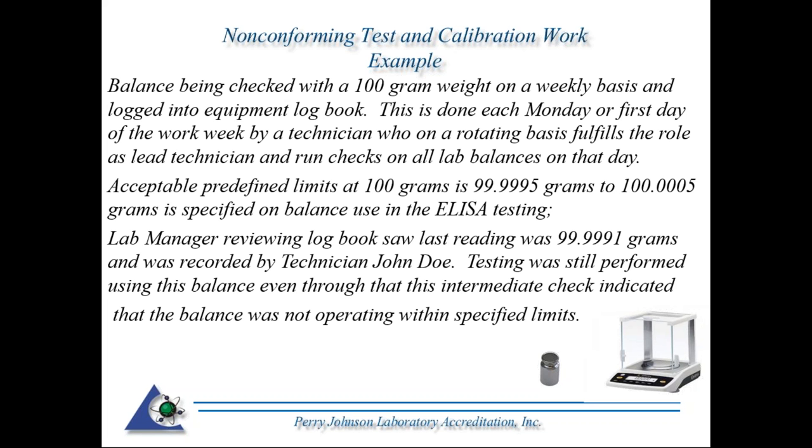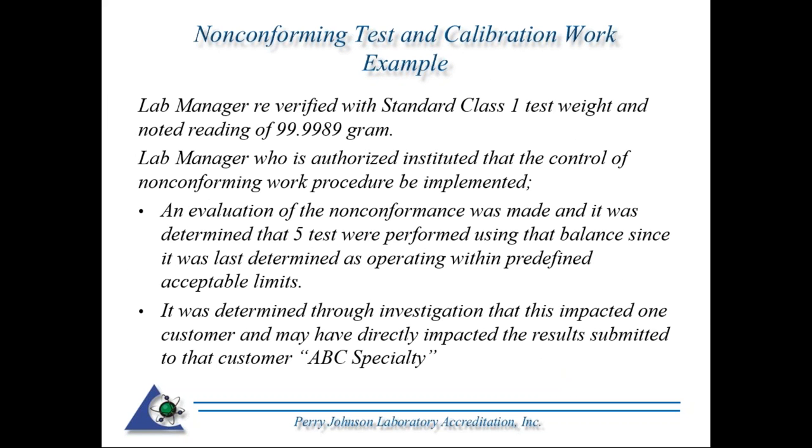As we have a nonconformance here, these results were out of predefined limits, and testing was still performed using this balance, even though this intermediate check indicated that the balance was not operating within specified limits. The lab manager re-verified with his own class 1 test weight and recorded a reading of 99.9989 grams. Hence, red flags are going off here. The lab manager, who is authorized, instituted the control of nonconforming work procedure to be implemented.